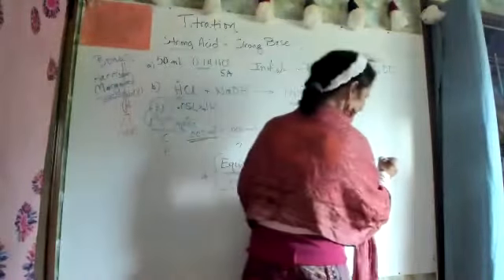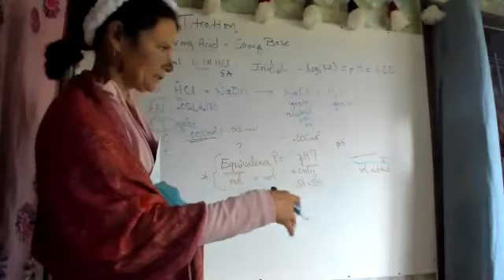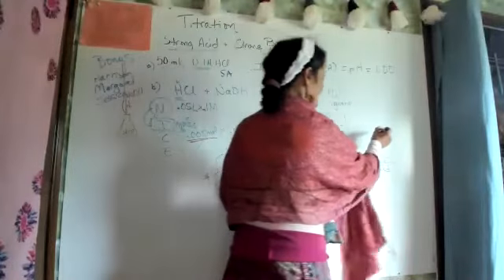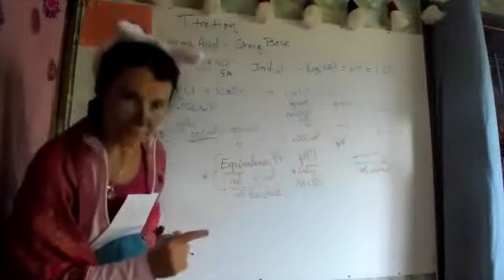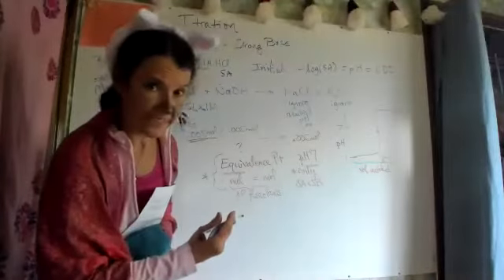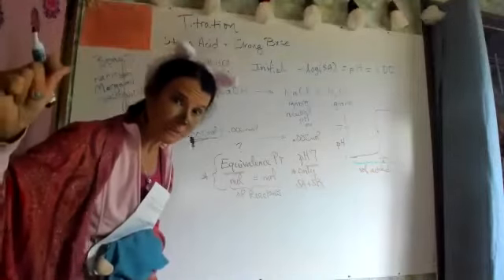All right, so what the curve looks like. In this case, it's at 50 milliliters. We'll go through how to find the volume on a next page or the page after. You are suddenly at a pH of 7. And it is a cliff. You cannot mountain bike up the equivalence point. You need a rope and a Sherpa, which you all have, a Sherpa as a teacher.